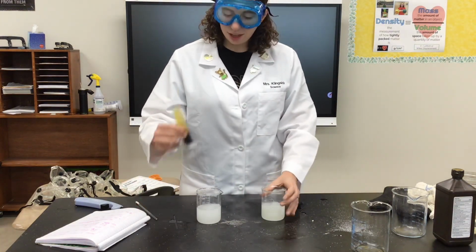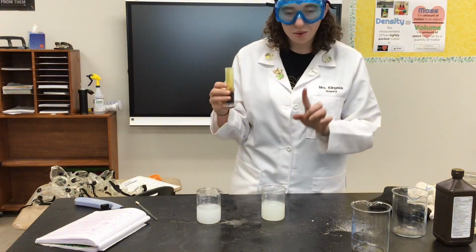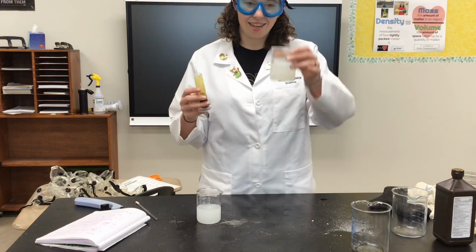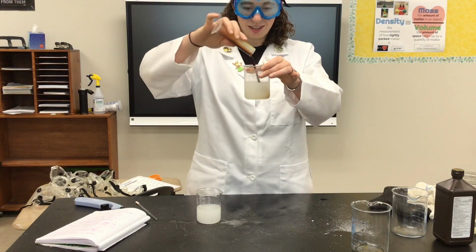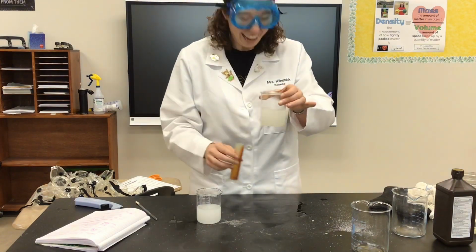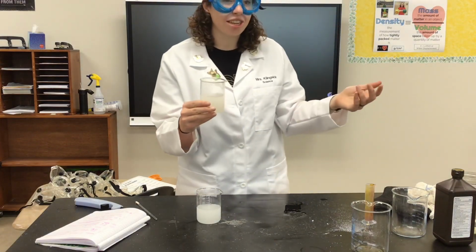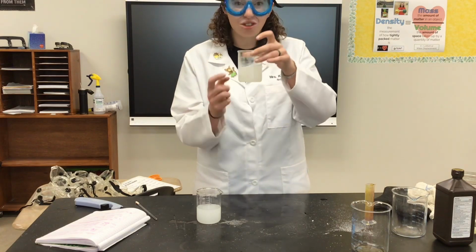So what I'm going to do first, this is iodine. It's 12 milliliters of iodine. I'm actually going to have this iodine disappear into my vitamin C mixture. Ready? Watch. Where'd it go? Oh, isn't that cool? I always like to say magic is the real science, or science is the real magic of the world. I mean, that's truly true with this one.